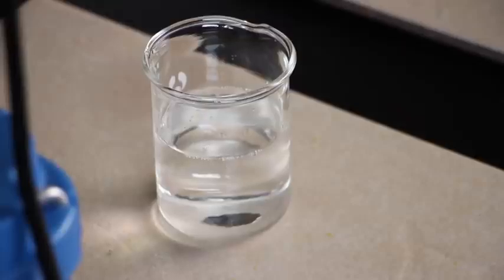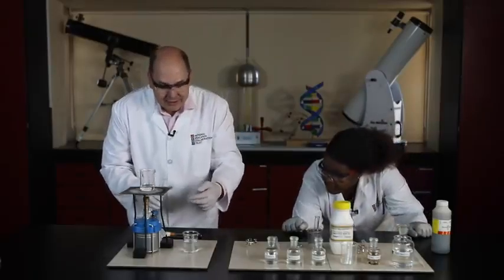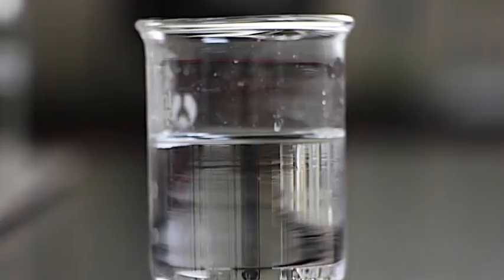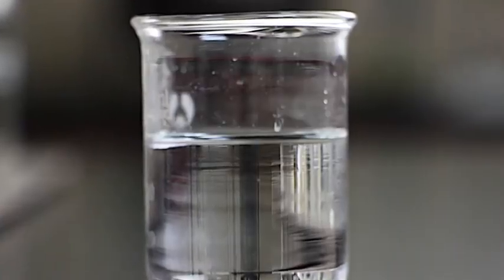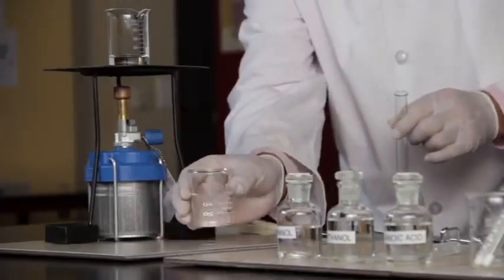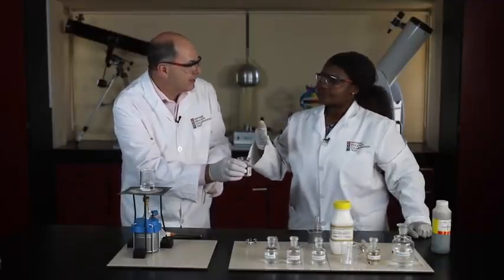That fizzing is an important thing to take note of. And you know what, Joyce? I can already smell something happening here. The layer of oily substance floating on the top is the ester. Have a waft at this mixture. It doesn't smell like vinegar, does it? Not at all.